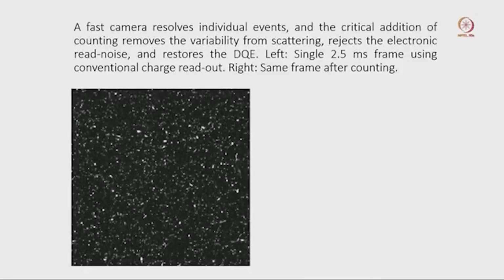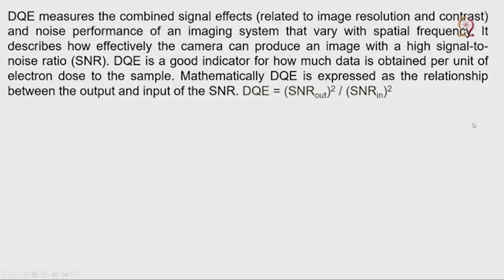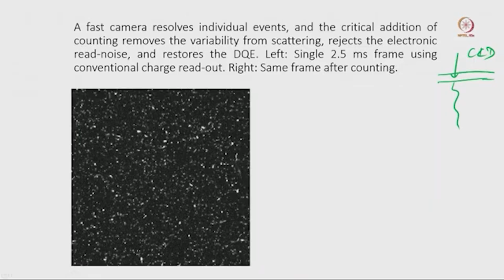We already discussed the readout, and we already discussed how this affects the scintillator. If this is a scintillator, as I mentioned, for the CCD camera, an electron hits and then travels through the fiber optics, and some of these electrons will travel in a different direction. If they hit, they will again generate some signal. So, here you can see this is collected from a CCD camera.